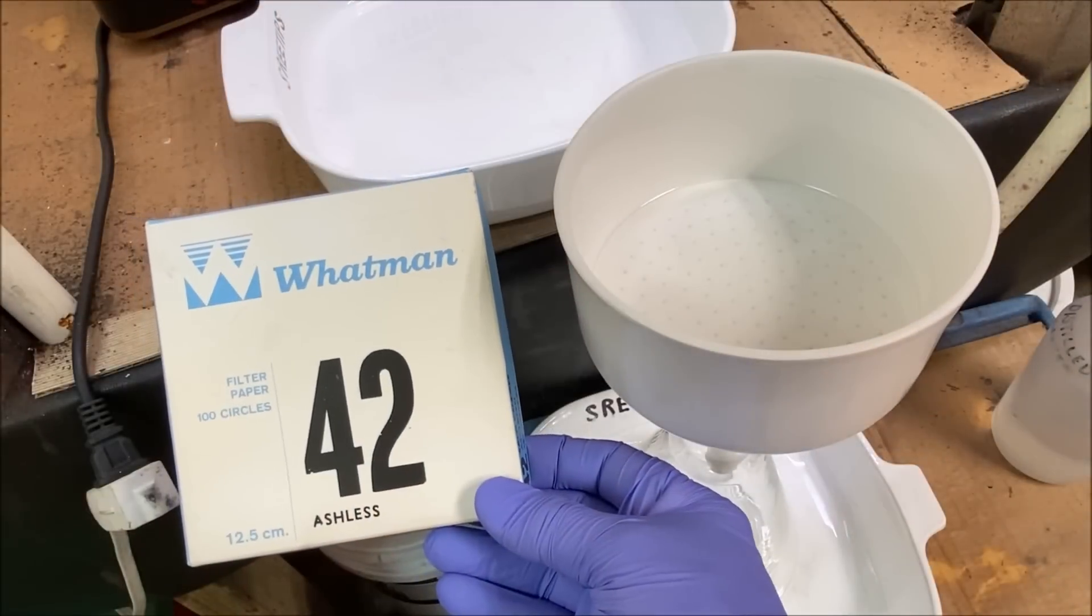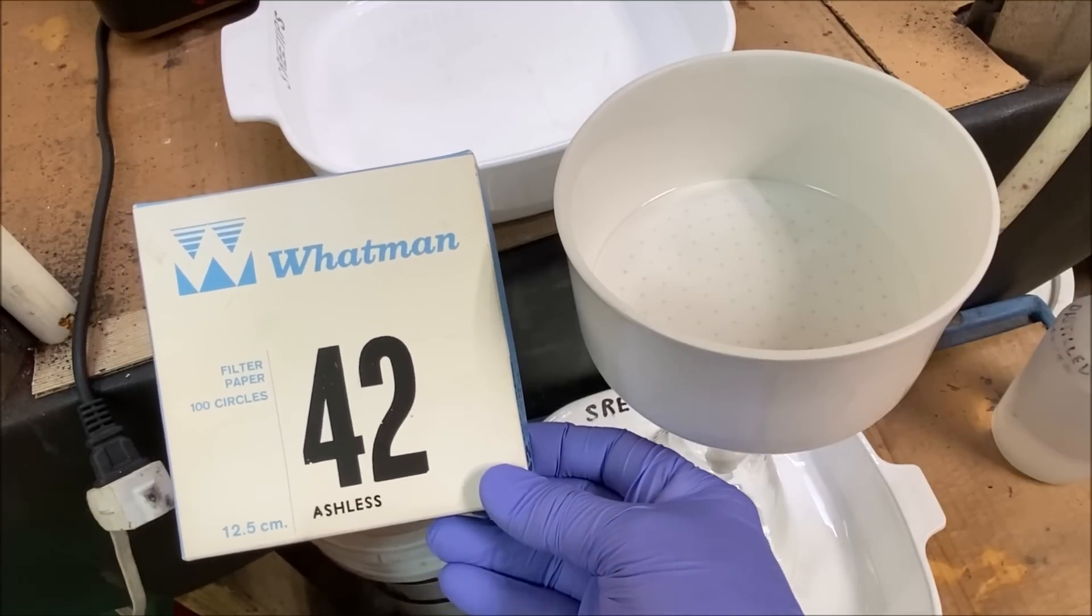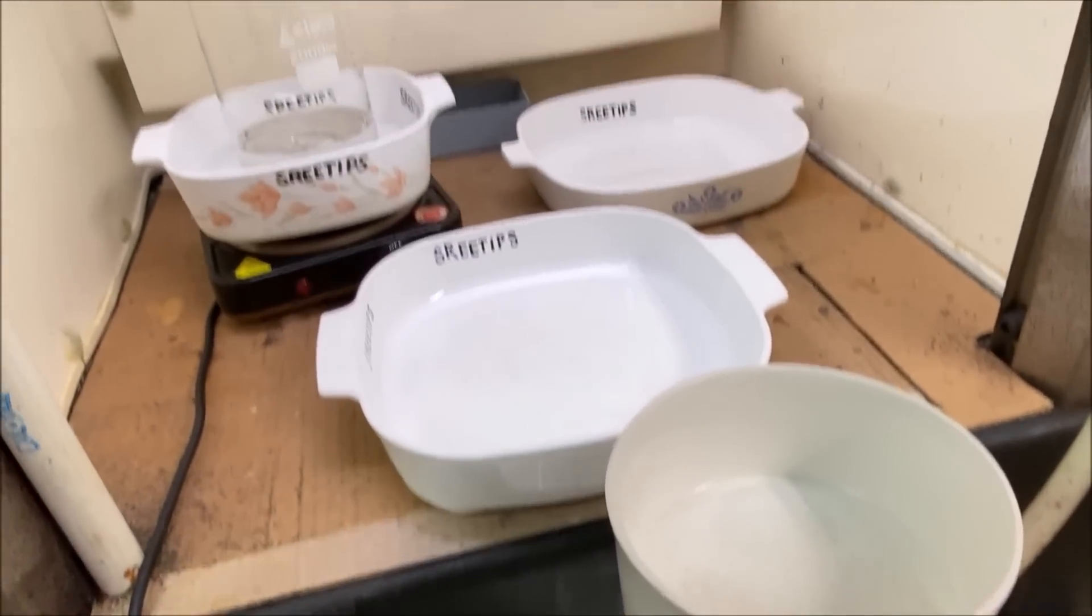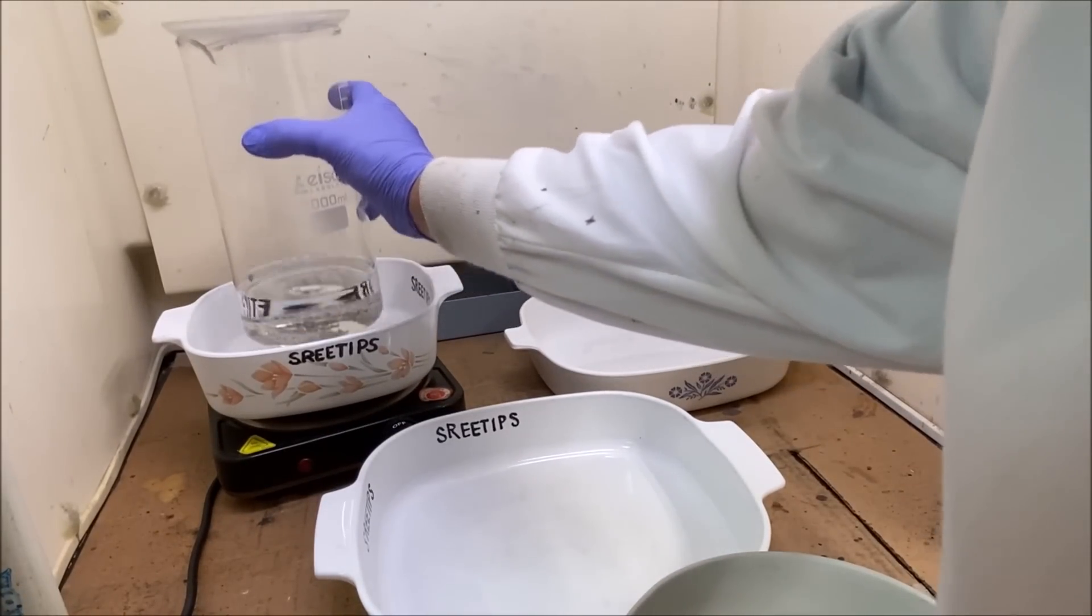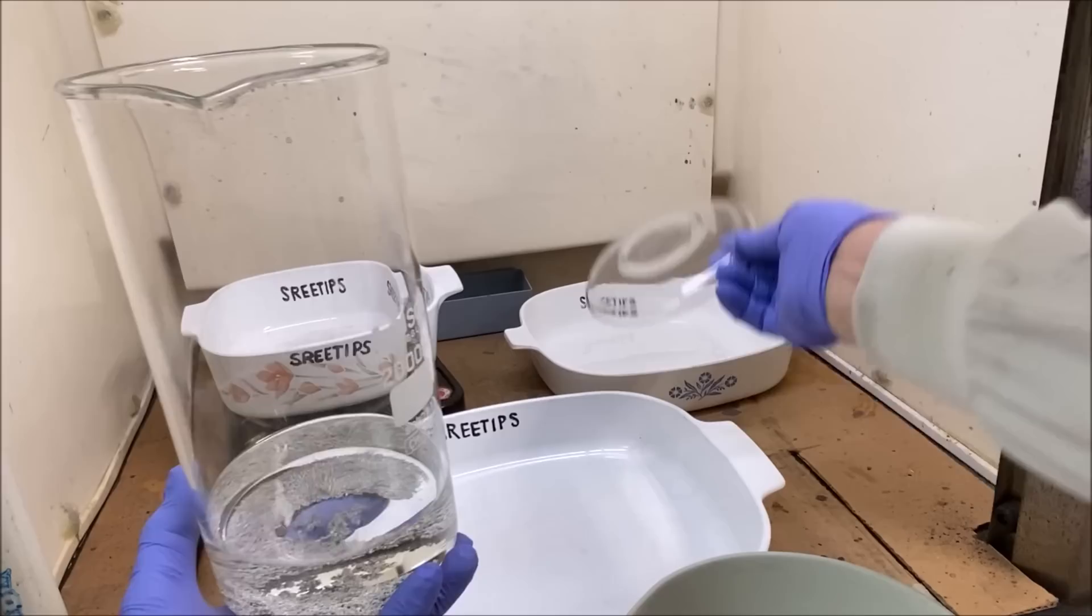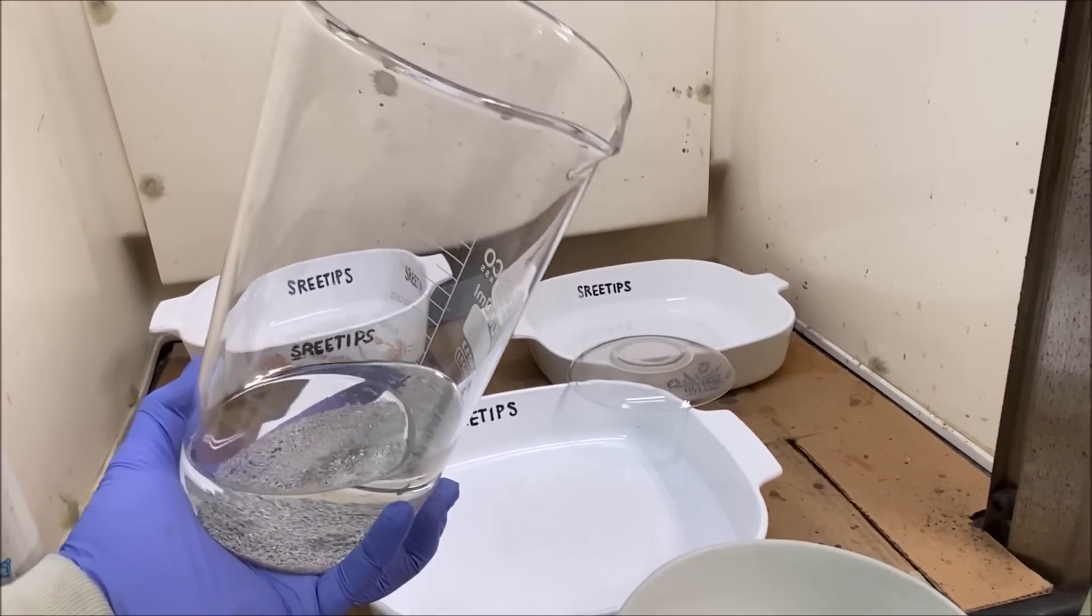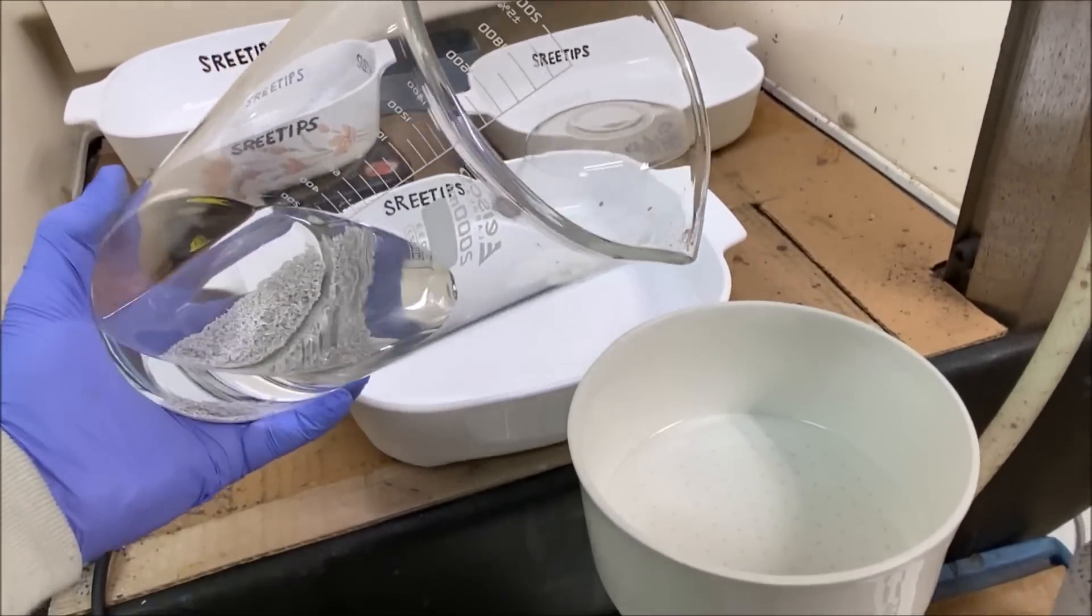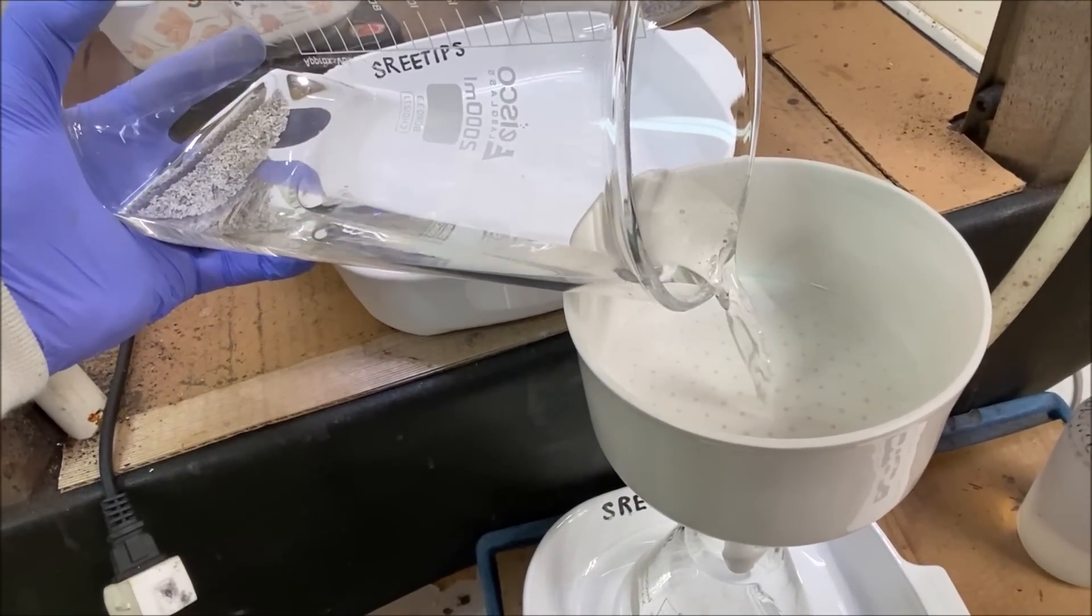I've got a funnel set up here with a filter paper in it. So what we'll do is reach back in here, grab our silver nitrate solution. This is about 100 grams of pure silver dissolved in about 400 milliliters of solution. I'm just going to filter this.